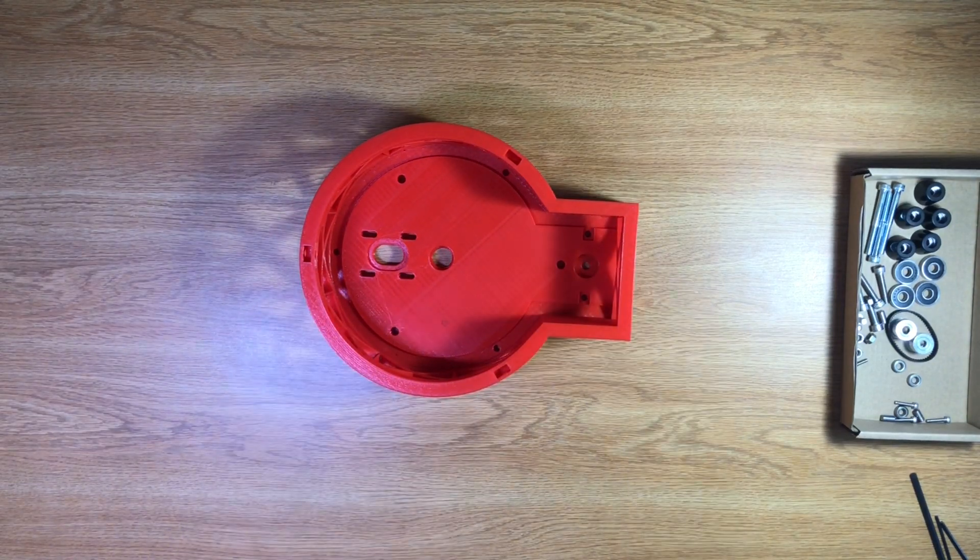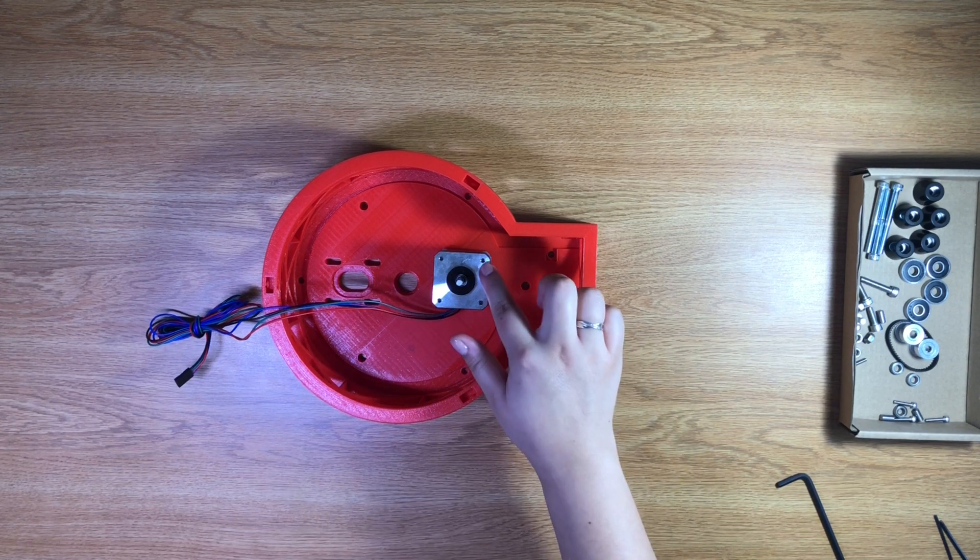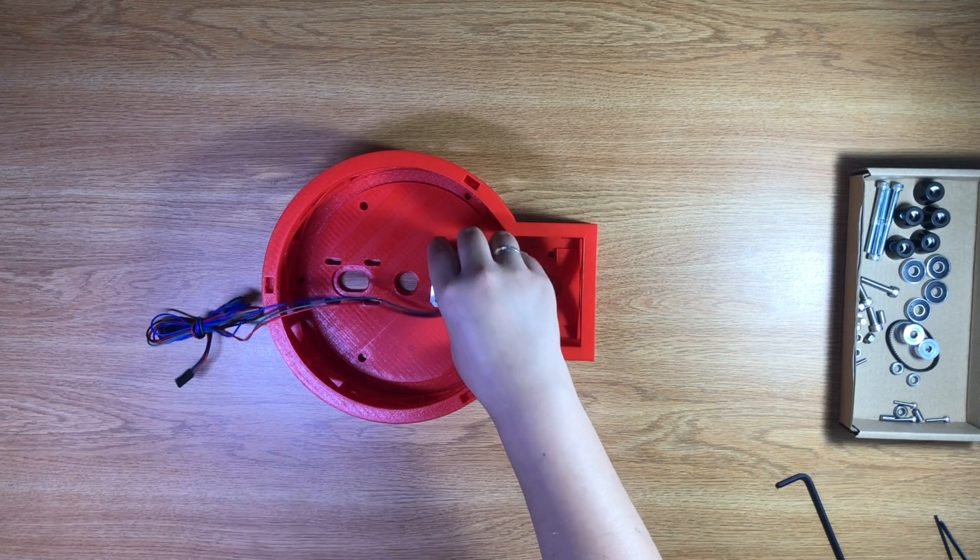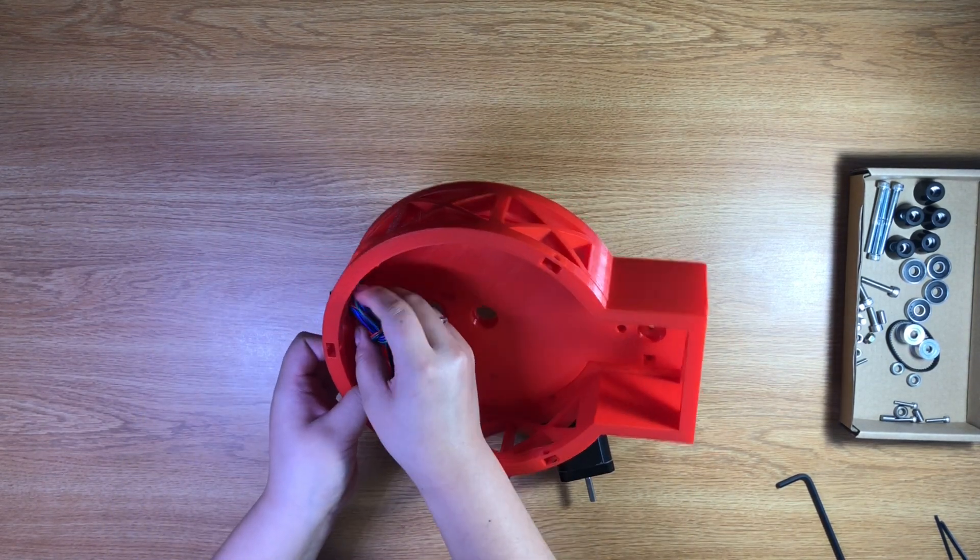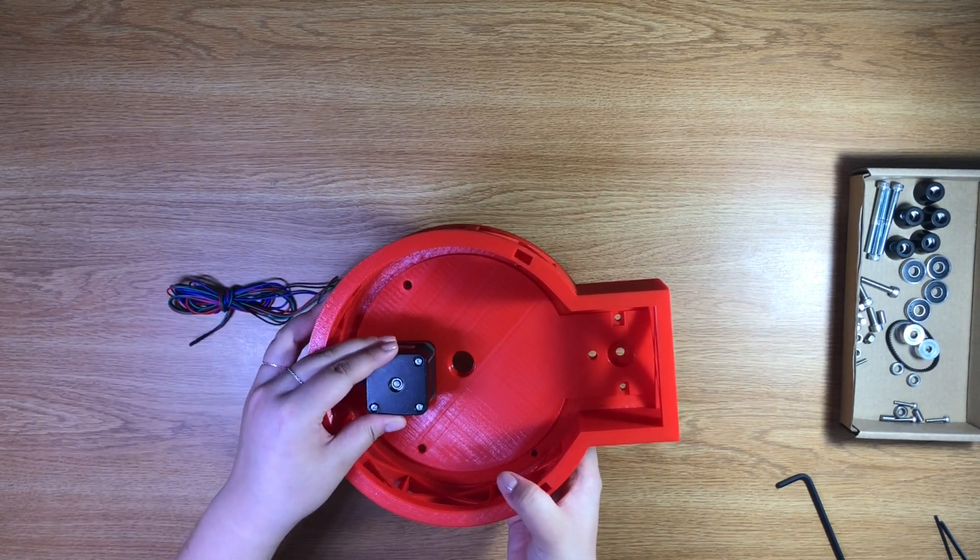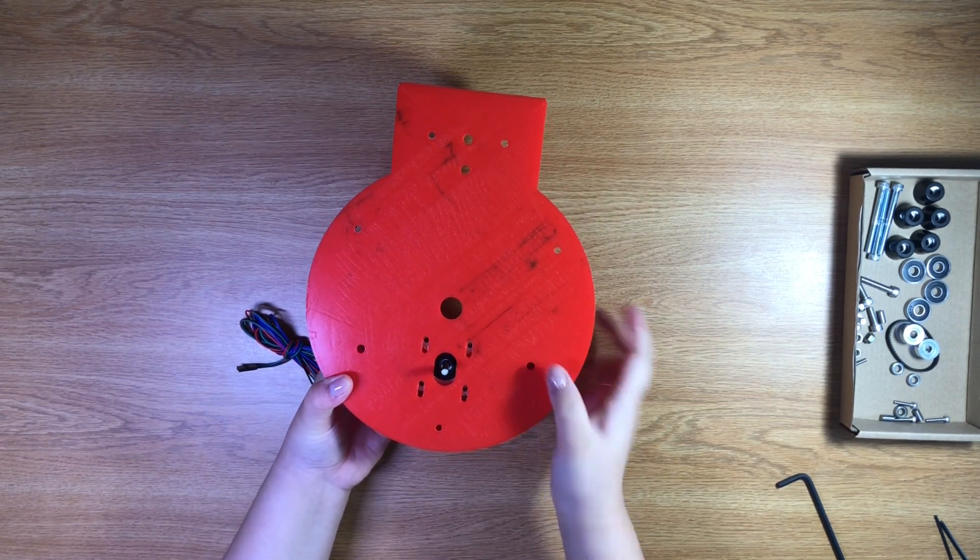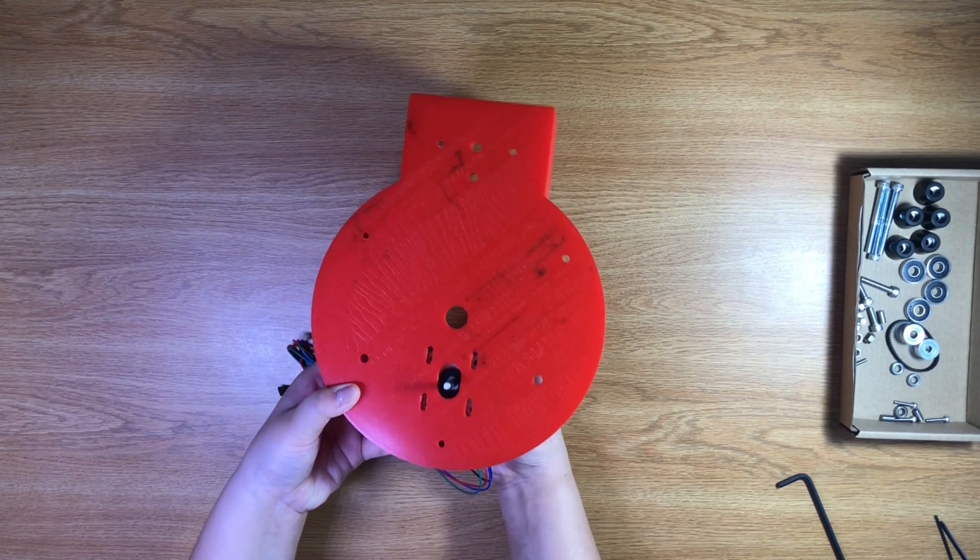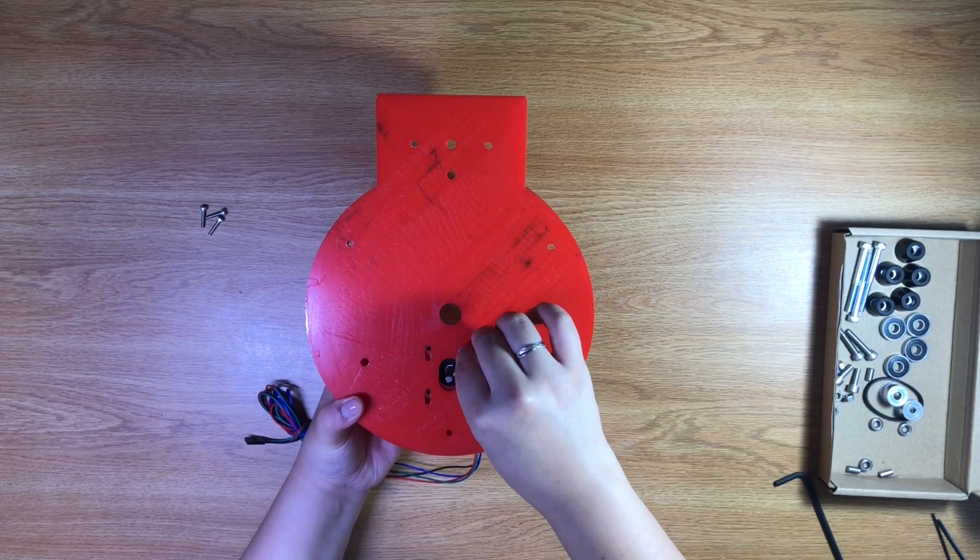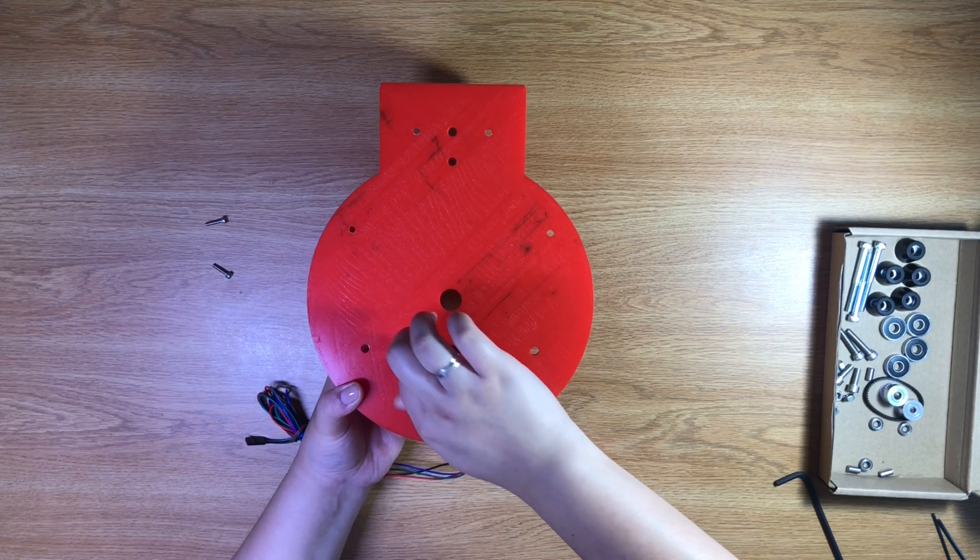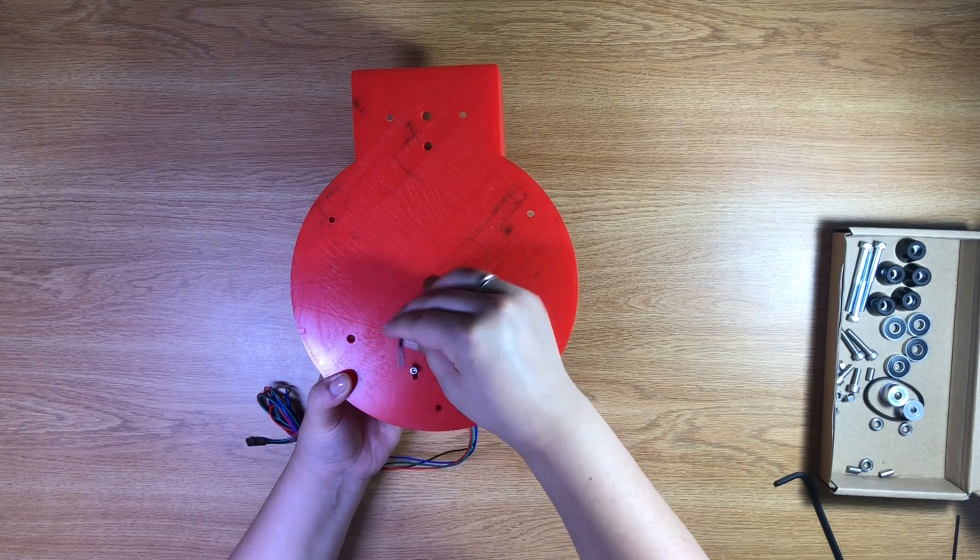Now let's assemble the base. We'll be using four M3 screws to attach the motor to the base. First, pull out the stepper motor wires through one of the openings on the base's side. Turn the base upside down and align the four holes of the motor to the four holes on the base. Notice how you can slide the motor along these holes to adjust the distance between the motor and the center shaft. Insert the M3 screws into the four holes on the motor and tighten them with hex keys until the motor is just barely set in place. We'll need to move this later on.